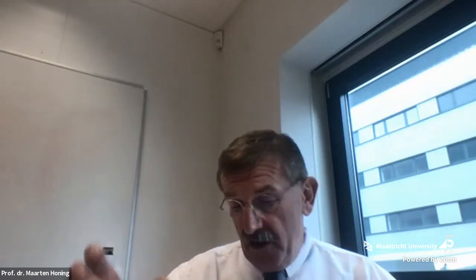Okay, interesting. Thanks for those discussions on definition. And maybe if I have still 2 minutes to go to page 115 of your thesis, where you show the research you did in the ozonolysis in the ion mobility system of the Synapt.